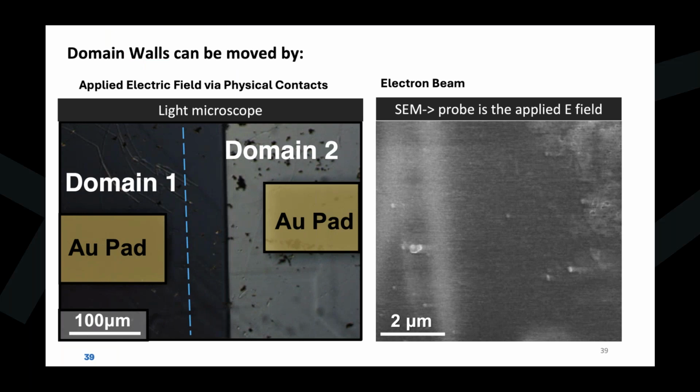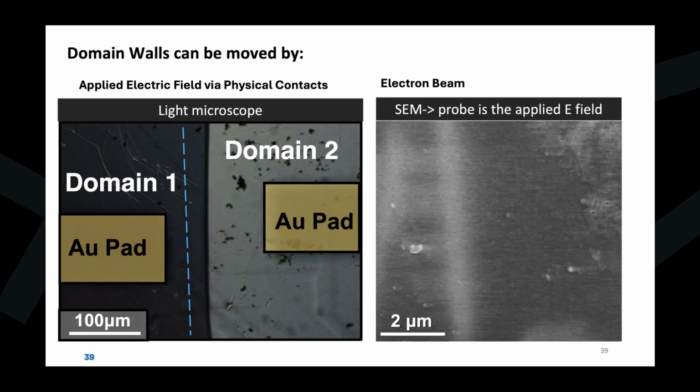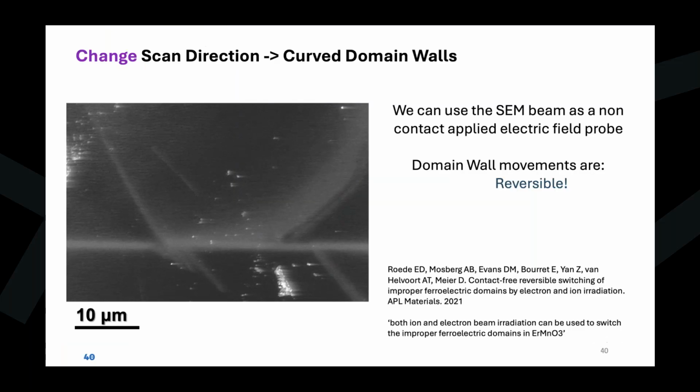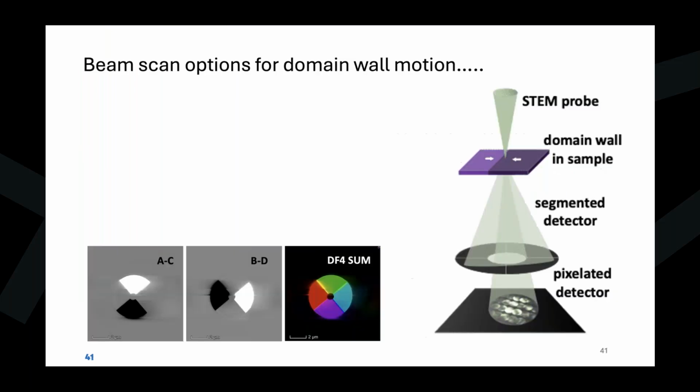All I could do was rotate the scanning probe direction, as most people know in this webinar. So if I moved my electron probe in the SEM around, I in fact got many different types of patterns that were not known before. Other groups followed this, and they've shown that in other materials they can see this as well. So we already knew that if we moved our electron beam position around relative to where the domains and the walls were, so these interfaces, we in fact could get very different patterns. So we knew there was something interesting happening there.